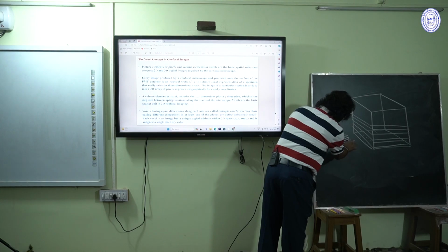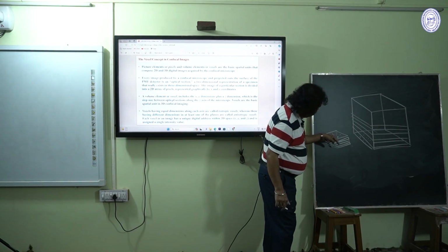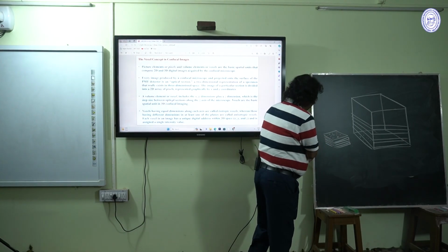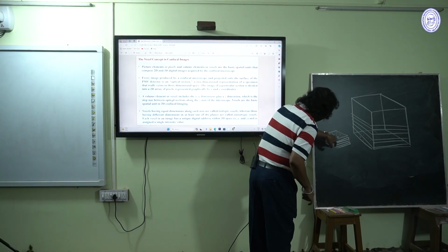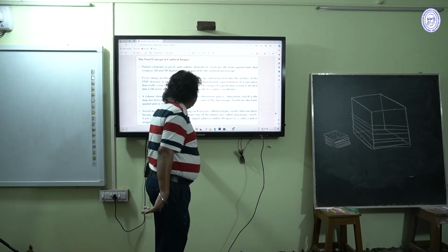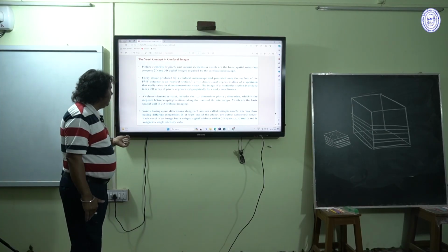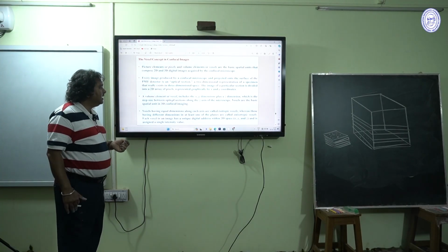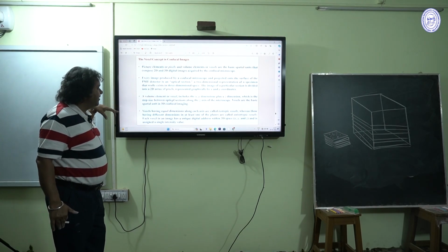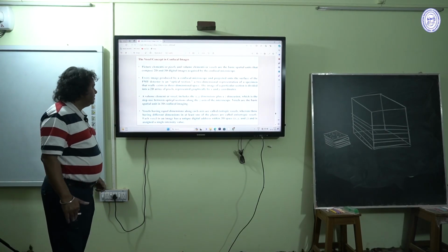If the layers are having the same quantity of pixels, or the layers having different quantity of pixels, so the voxels can be divided into two types of voxels: isotropic voxels, voxels having equal dimensions along each axis are called isotropic, whereas having different dimensions, at least one of the planes, are called anisotropic voxels.